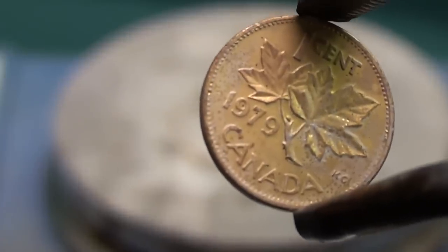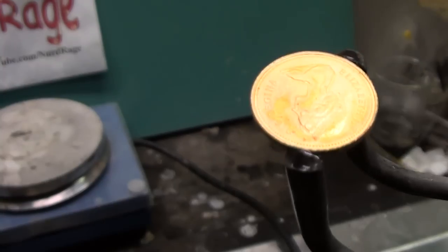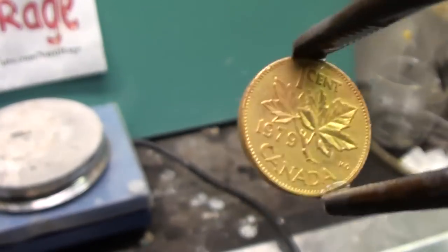At first it's going to look coppery, but that's because it's still hot. After you cool it directly with water it will now appear gold. Don't try to pawn this off as actual gold though — the brass layer will eventually wear off.